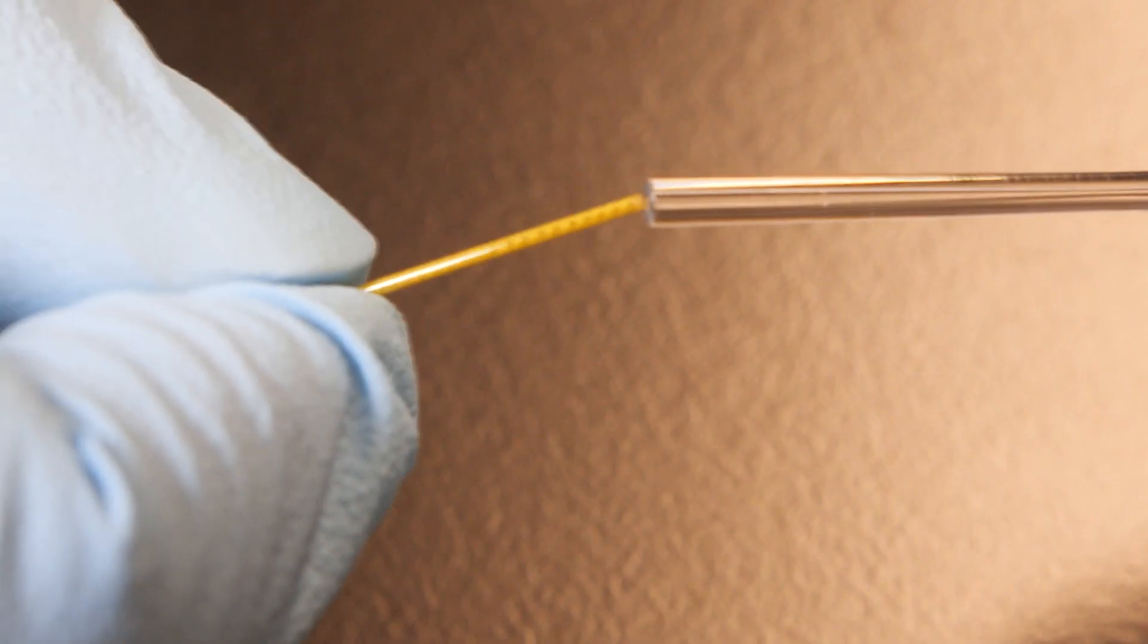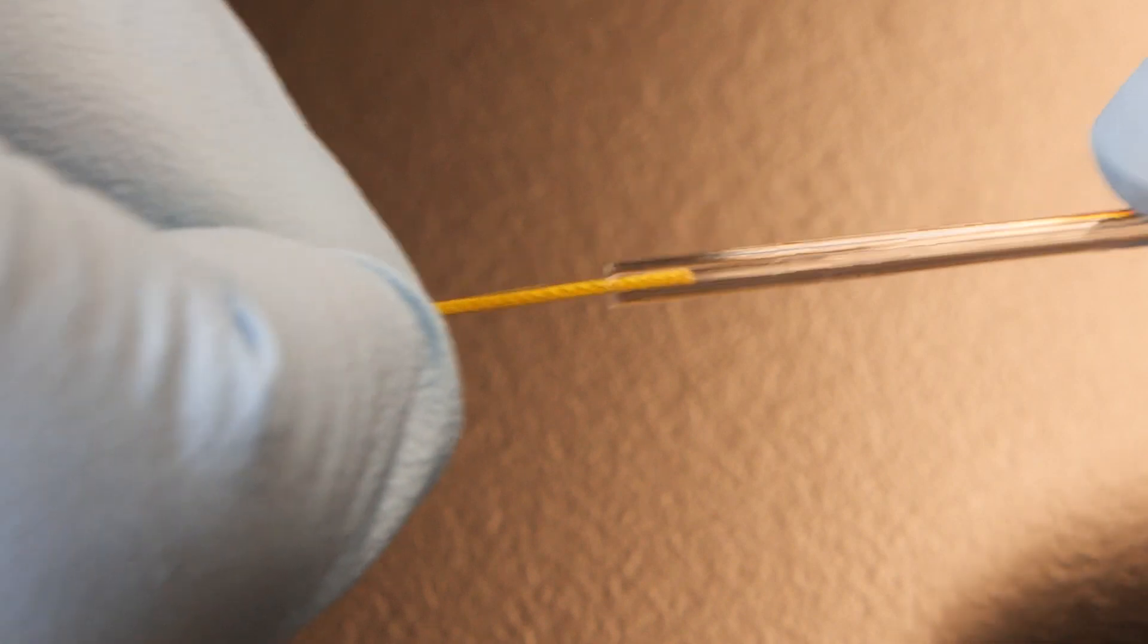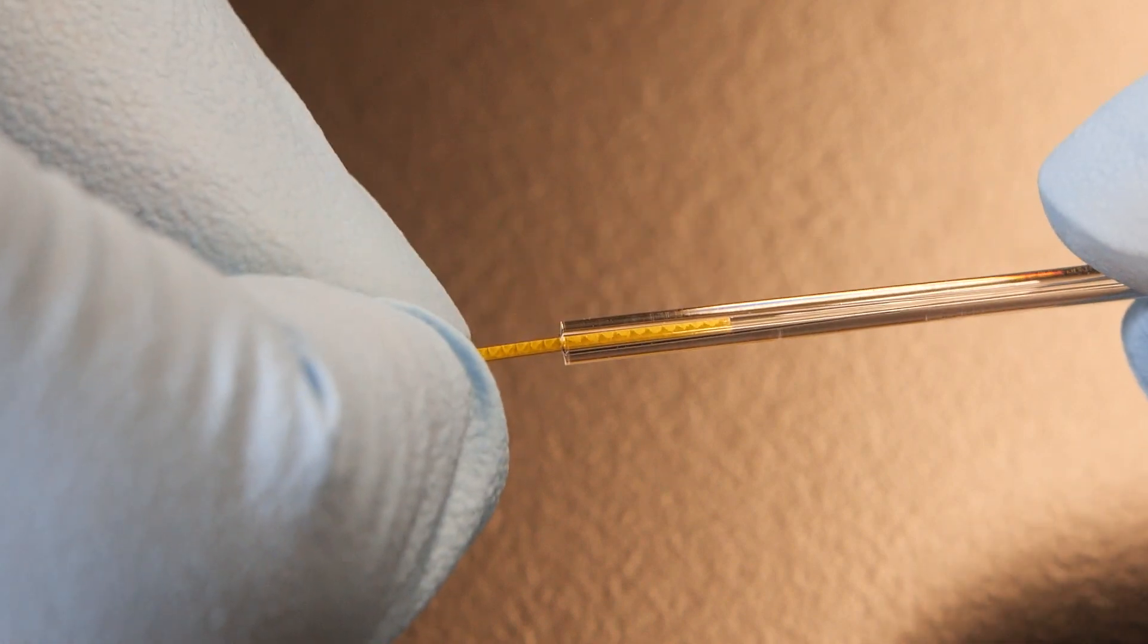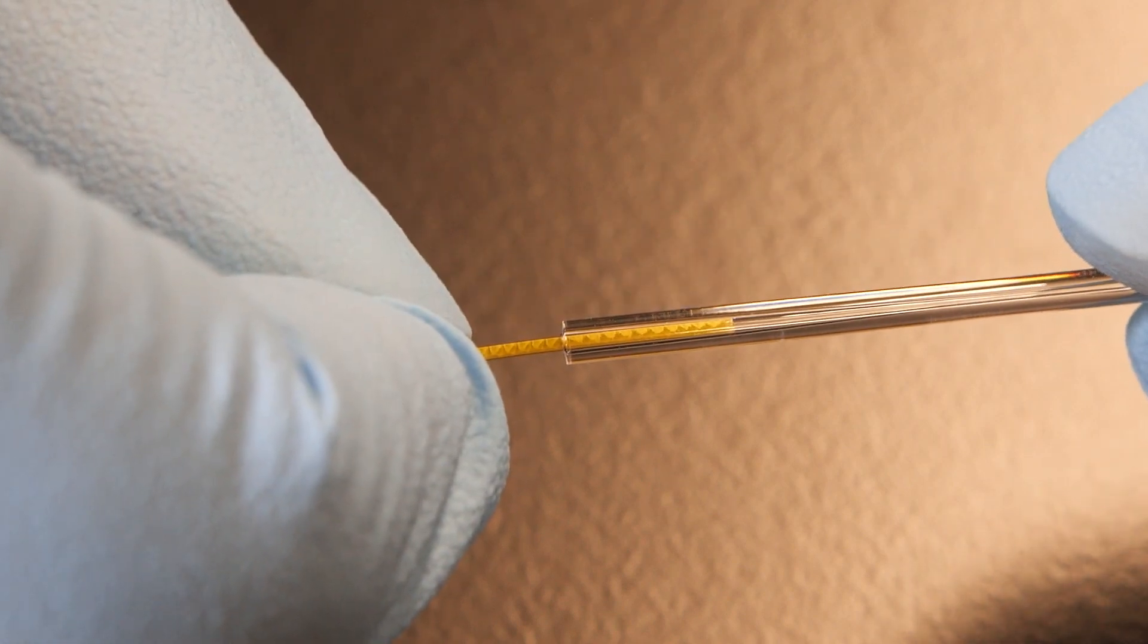Now, we'll connect the columns together using the press-tight connector. While holding the connector in one hand, gently insert the plot column end into the connector until it is gripped firmly. Be careful not to press too hard or the column end will crush.